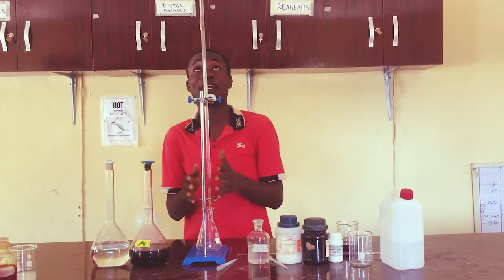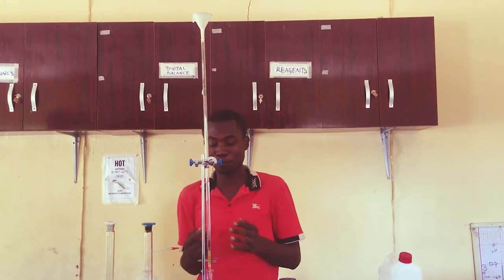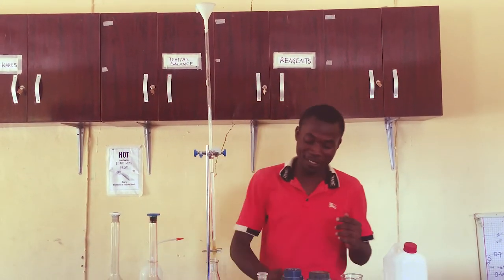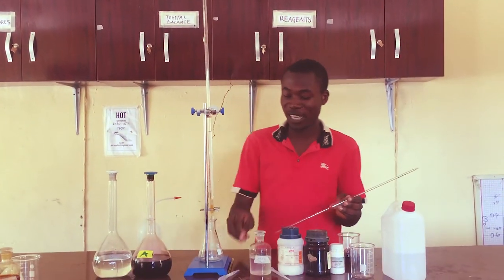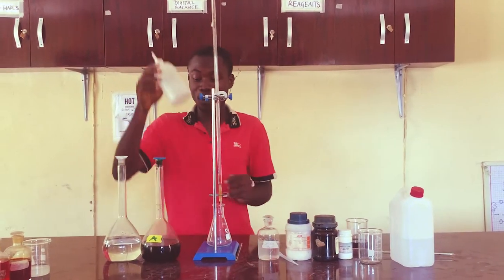And we need a titrating apparatus. This is our funnel. We have our burette, our pipette, our retort stand, our dropping pipette, and then we have a wash bottle.